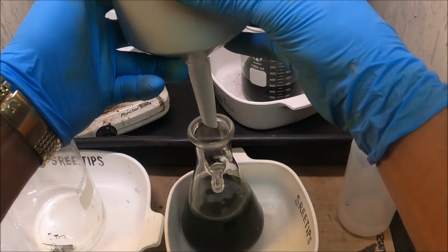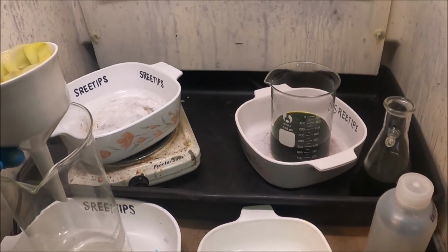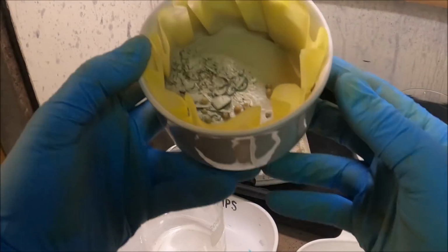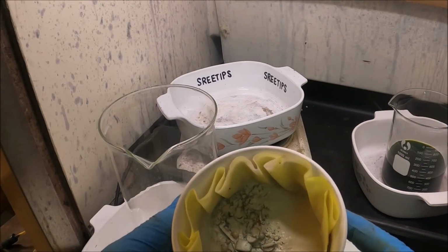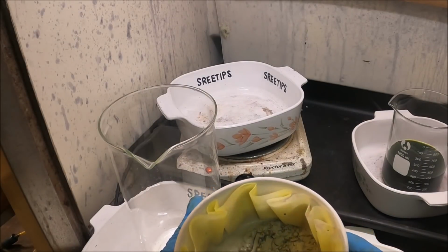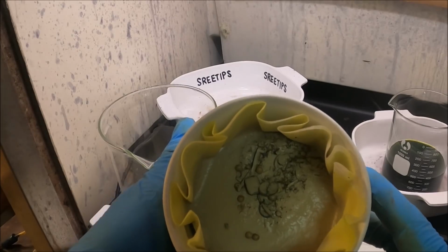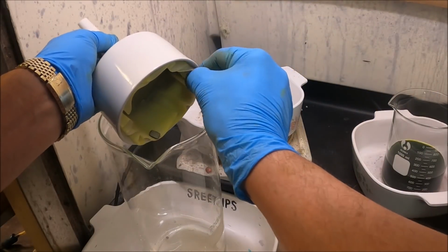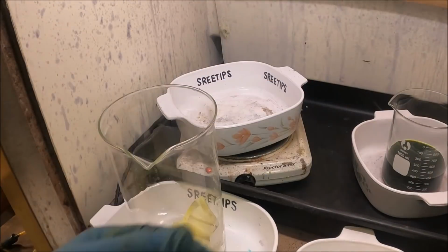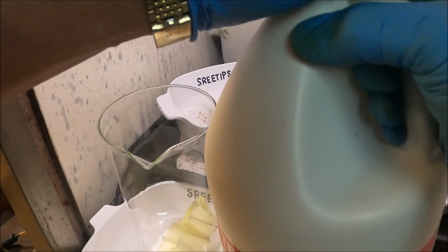Now what we're gonna do, I'm gonna set this aside. And what I think next course of action should be, put this back in the flask there. Might be some solid pieces of metal left in here. So I'm gonna put this back in the flask. And now I'm going to add a little bit of hydrochloric acid.